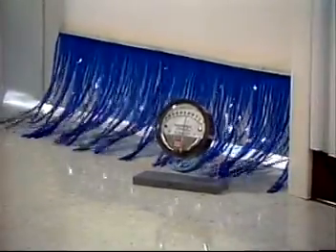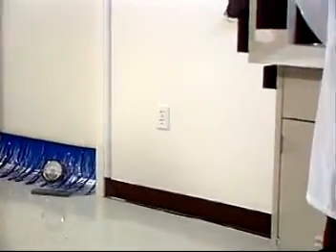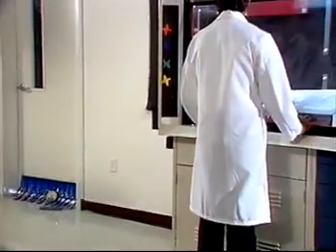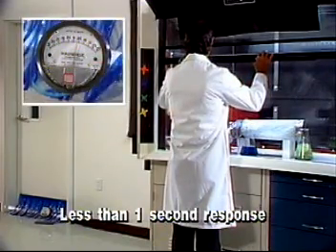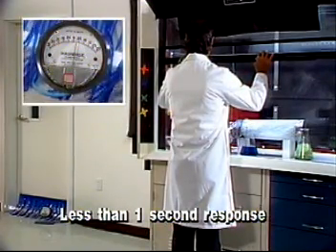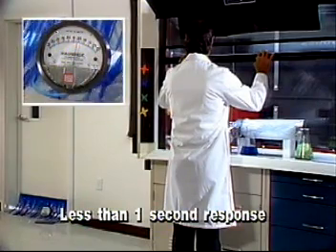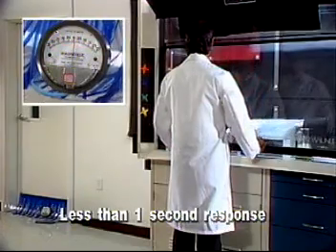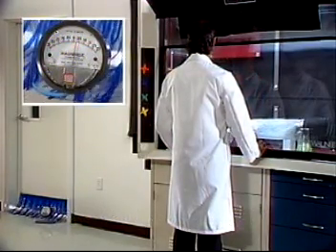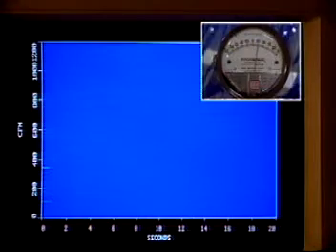room pressurization. Our first test shows the effect on room pressurization when the room makeup air tracks with the hood exhaust within less than 1 second. Notice that the room pressure stays steady and stable as the sash is raised. When the operator lowers the sash, the room pressure remains stable with no fluctuation to a positive state.